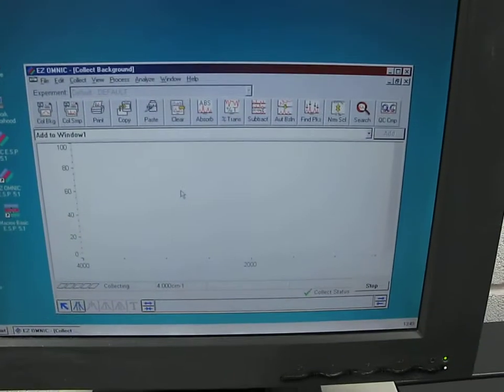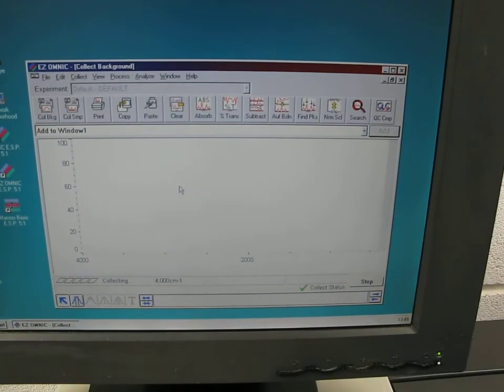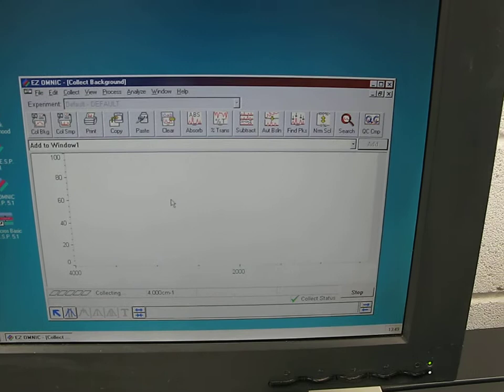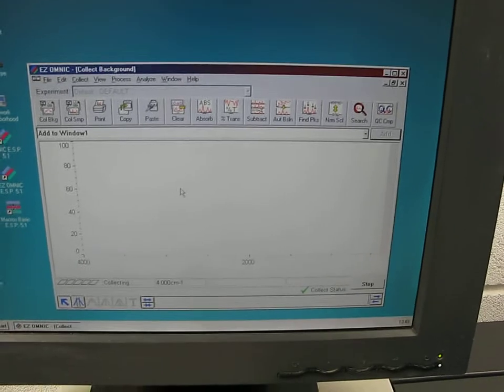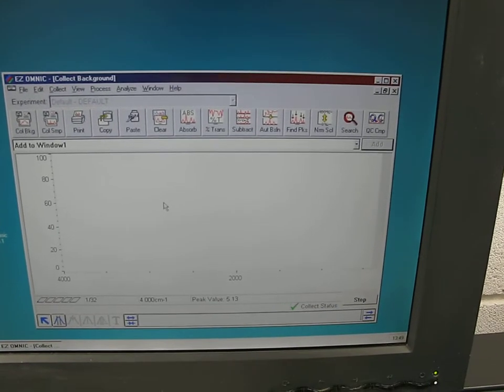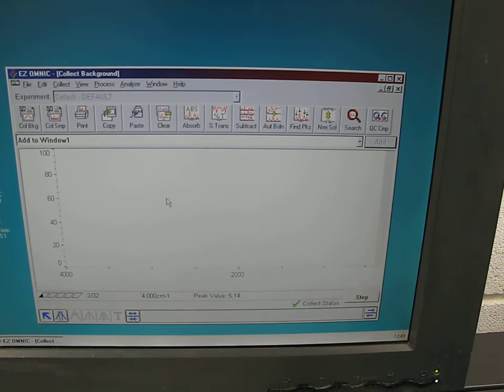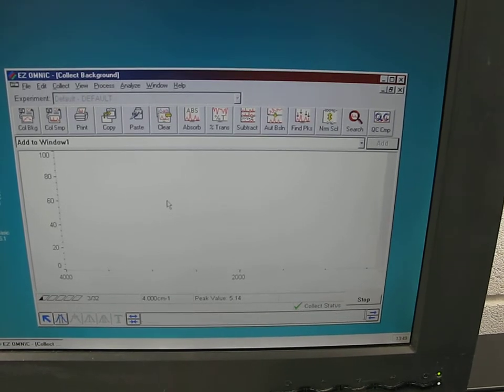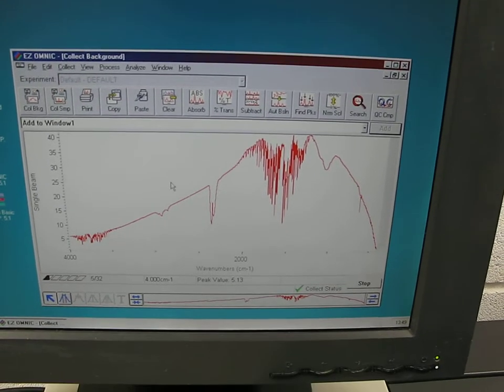We'll probably do about 32 of these. Should see a nice typical background scan coming in, so let's just have a look, you can see what we can get from this. Okay, so it's starting, there we go.